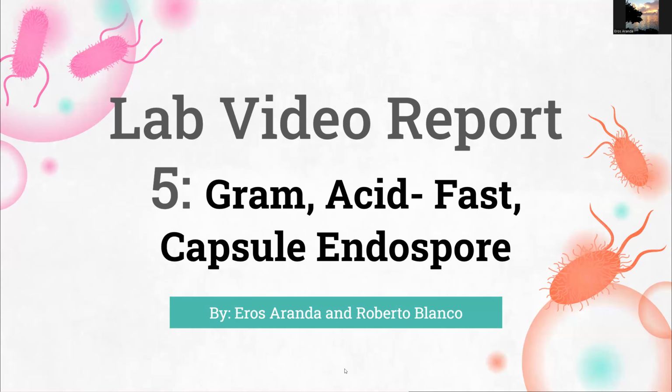Howdy, my name is Eros Aranda. My lab partner is Roberto Blanco, and this is our lab video report on gram, acid fast, capsule, and endospore staining.